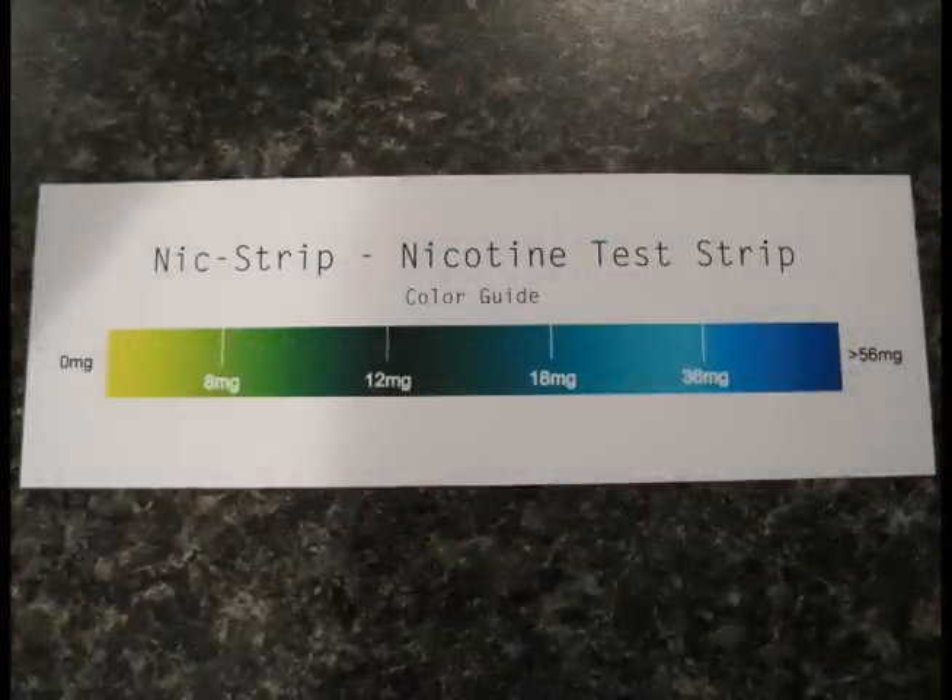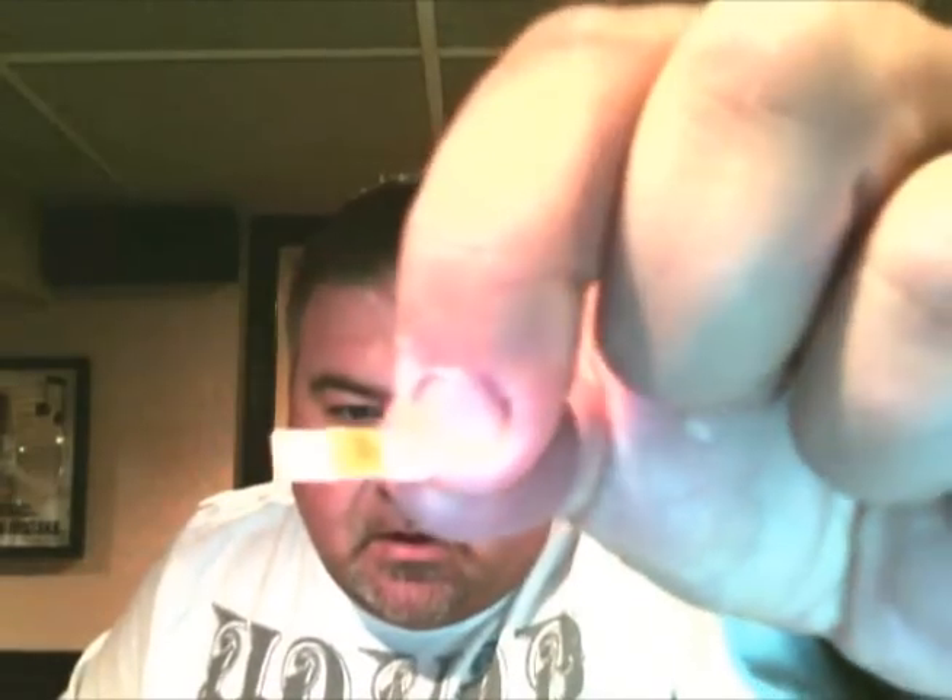The instructions say that you take your liquid, put one single drop on the pad, blot it dry, and then let it sit for five minutes. So that's what we're going to do. This liquid — I'm not going to say who this is from — but this is a 12 milligram liquid. Here's the test strip. We're going to drop one drop on it. The color is already starting to change — it was like a clear, almost light yellow before, and now it's turning like a greenish color. So I'm going to blot this dry and let it sit for five minutes.